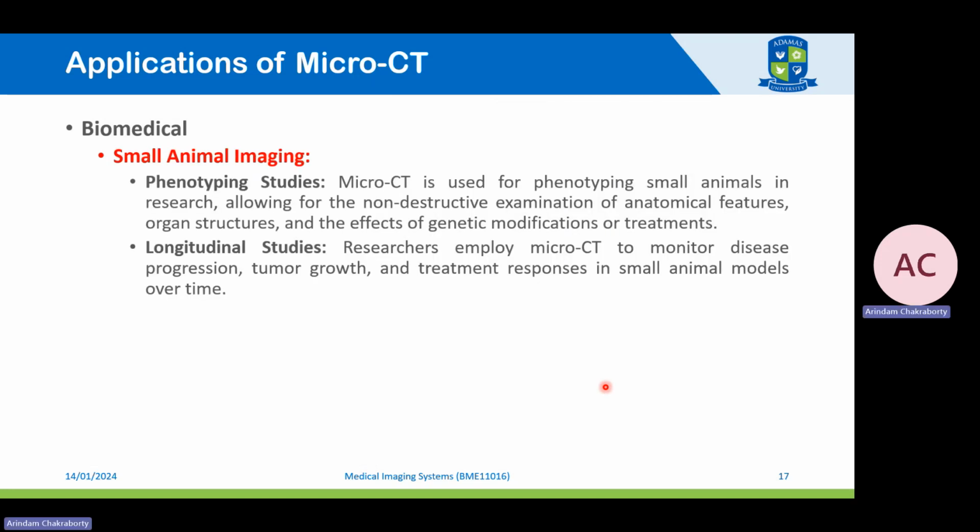The next thing is the imaging of small animals. If any implant, for example a dental implant, is placed in an animal, and the purpose is to see how the implant performs, previously those animals were sacrificed to do histological sectioning of the implants to see the bone growth in the structure. But with the advancement in micro-CT, now temporal, time-specific data can be obtained, where the bone growth or the bone turnover can be seen for different time periods.